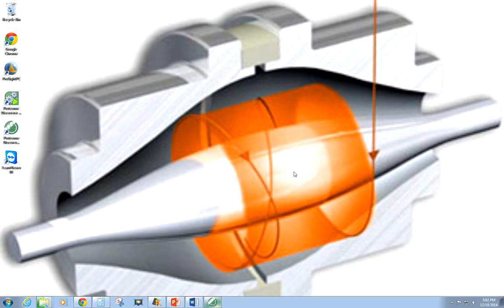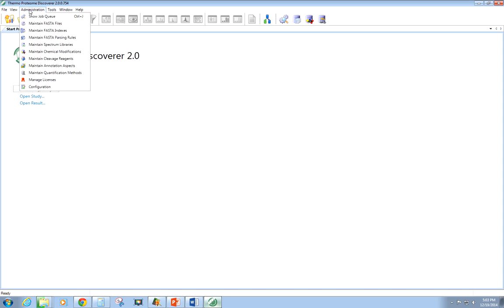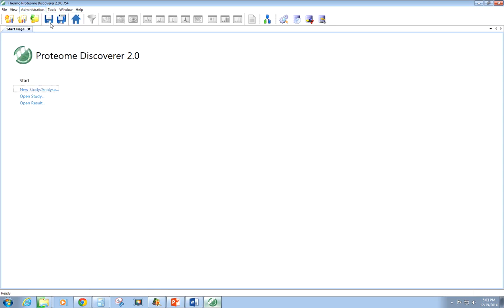In this video, I'm going to show you how to import FASTA files into Proteome Discoverer 2.0. So I'll open Proteome Discoverer here, and as in previous iterations, there are a lot of things that we can find by clicking on anything in the Administration tab.